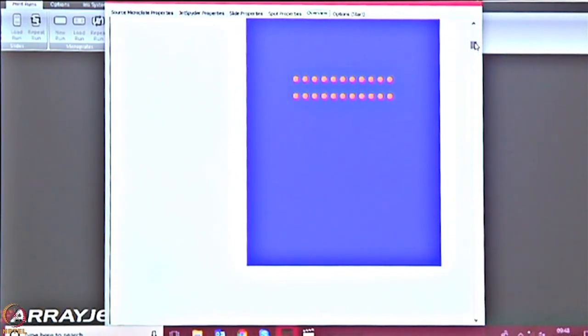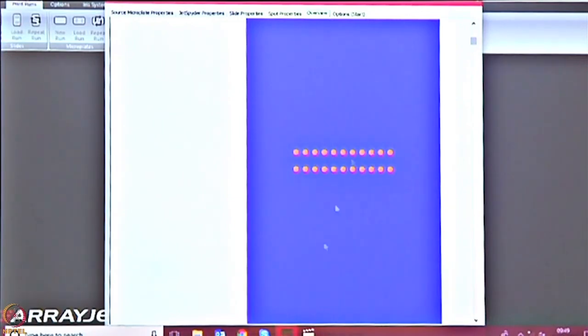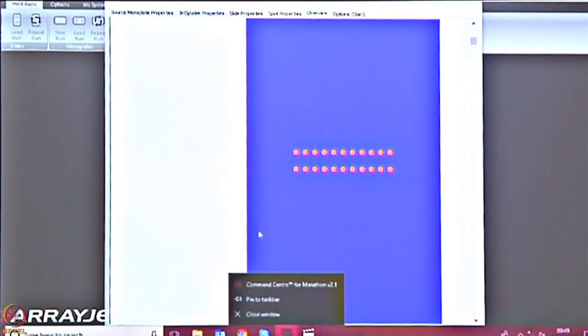So this is your one square. And now I have designed it, just while talking, in such a way that it looks pretty. It's good morphology and differentiated spots. So now you can tell that, yes, this is something that I can work with, I can develop my assay. There could be many other biological samples that you can get in this square. So this is just one.